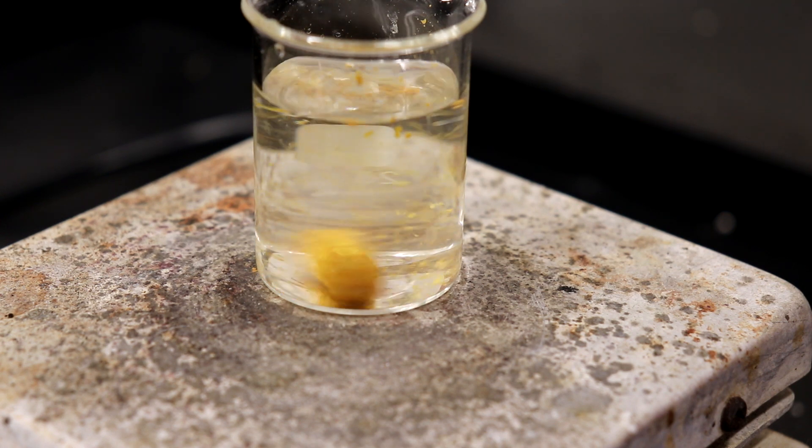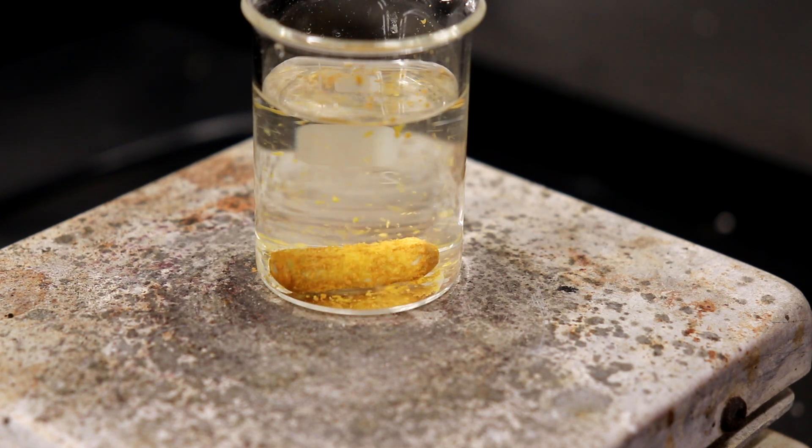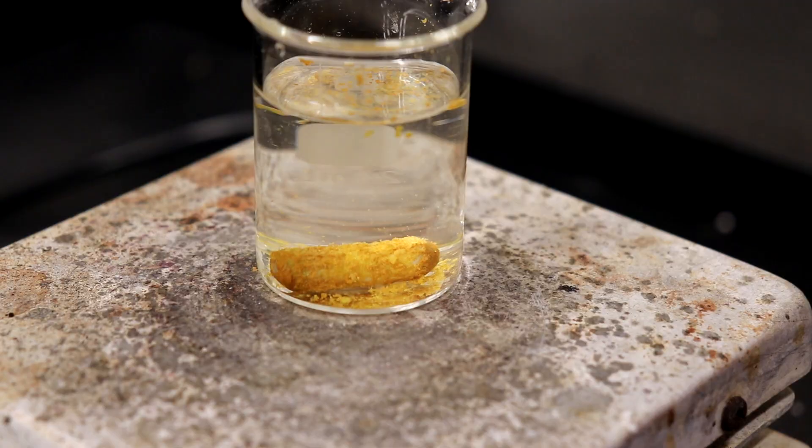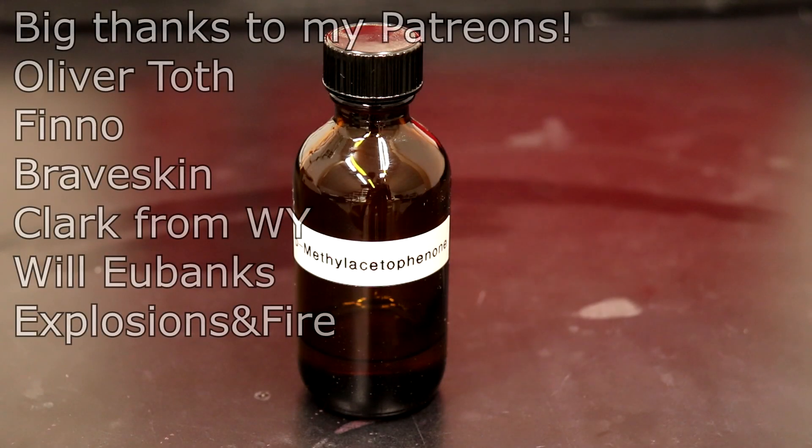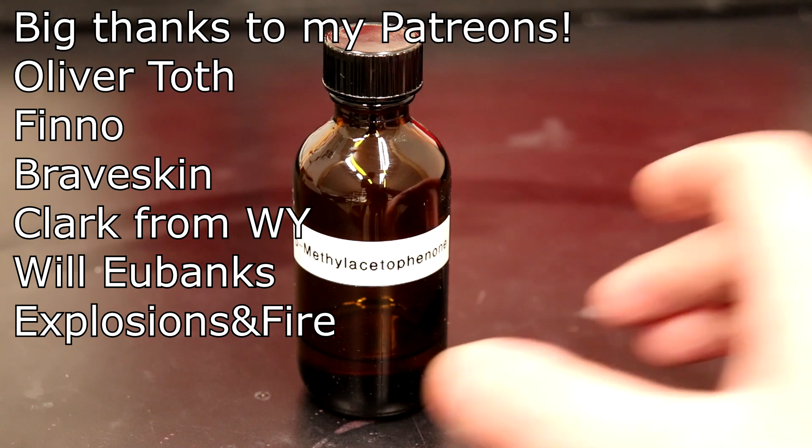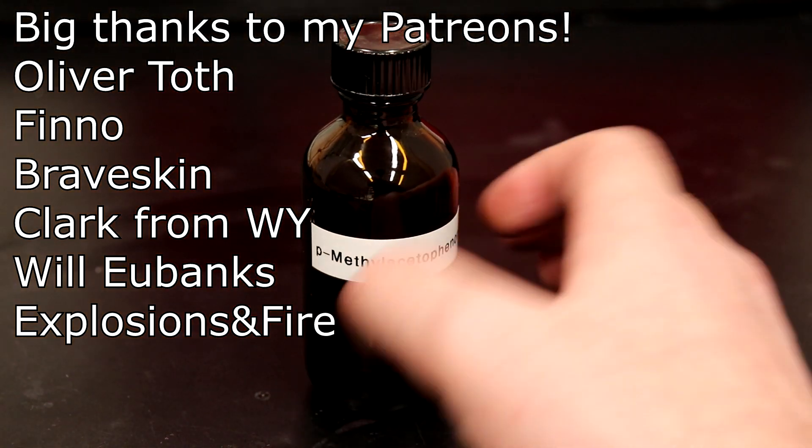Both of the samples produced a solid yellow precipitate, indicating a positive result for methyl ketones, which is a very strong indicator that we actually have the product that we're looking for. Despite the abnormal boiling point during the vacuum distillation, these tests show that the desired product is at least present in the two samples in significant quantity, which is adequate enough for my future plans with it.